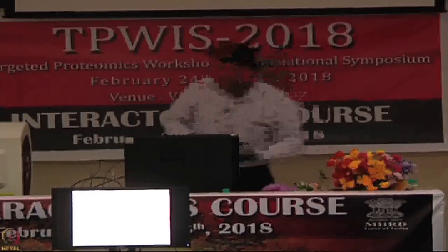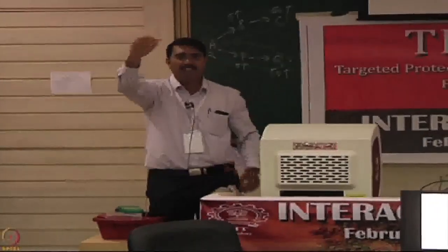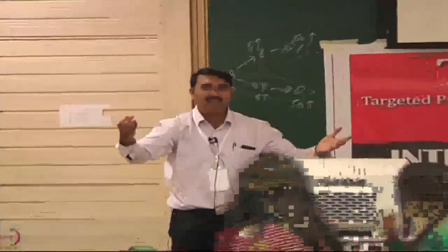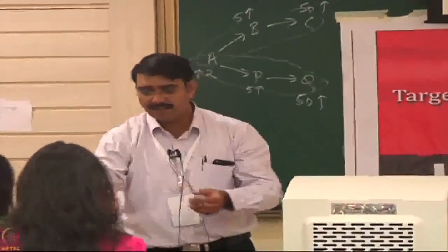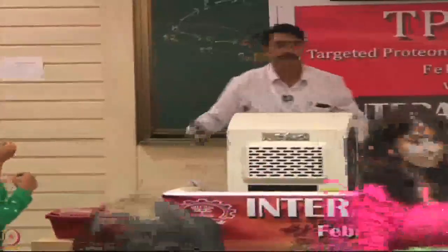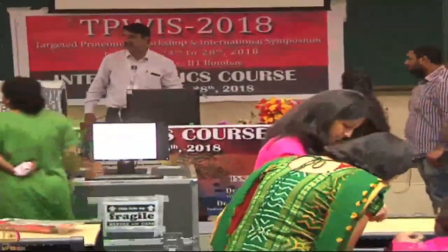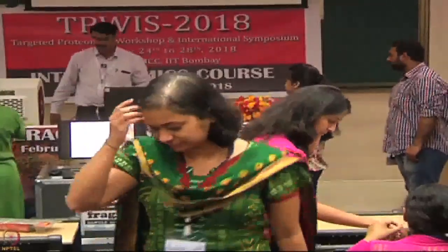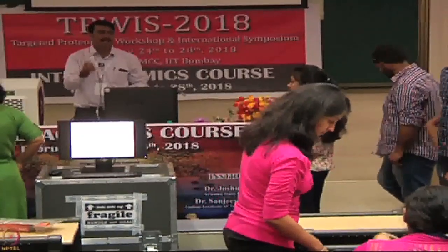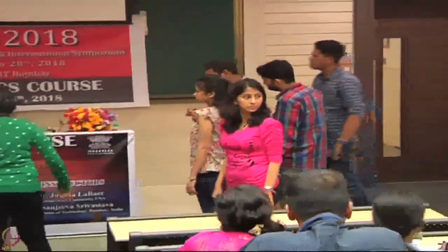So I can show you, these are the sensors. Typically it's like this. If you come around here, you can see how exactly it looks. Or later, once the experiment is done, you can look at it. Either you can pass this tray to everyone there, to see how it looks. Typically it looks like your injection needle. Everything is happening at the tip of the surface, the interactions. The surface area of this fiber optic is only 600 micrometer in diameter.